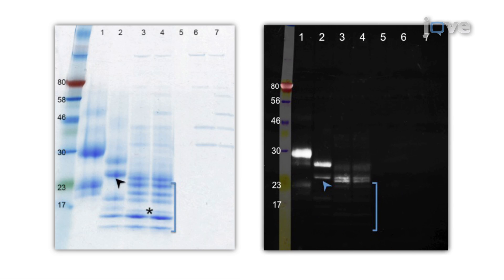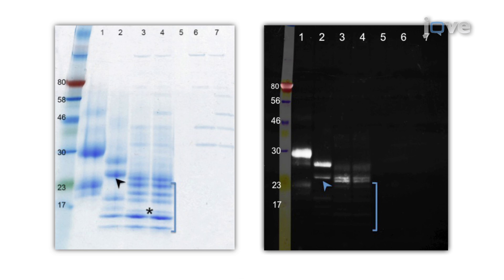Next, SDS-PAGE followed by Coomassie Blue staining and a sugar-specific staining method, ProQ Emerald 300, are used in order to analyze the deglycosylated HCG beta sample.